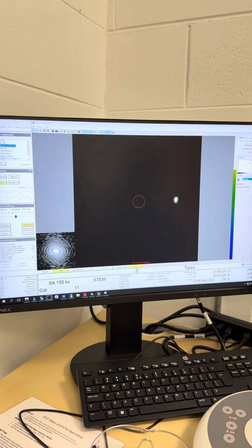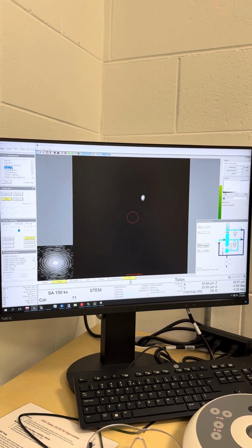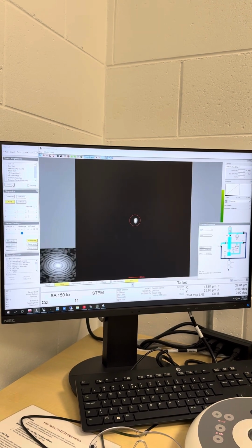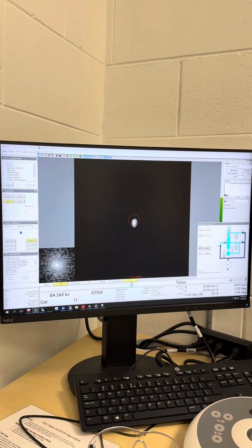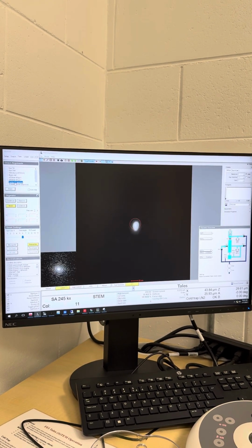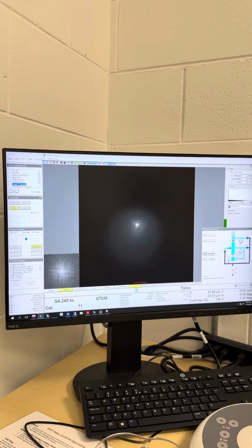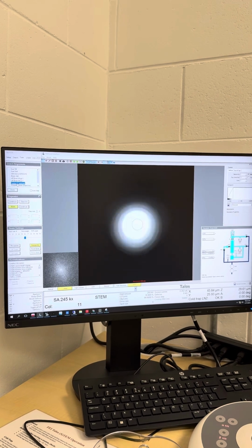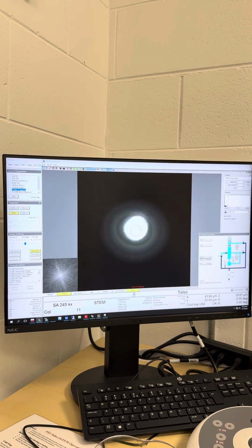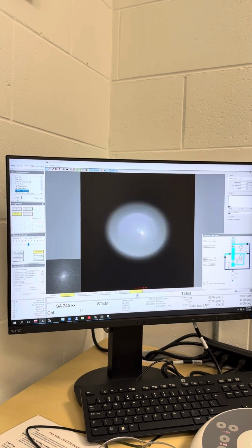So let's start with beam shift. So beam shift, X and Y knobs, you bring it to the center. That's done. I'll go to 225, which is, okay, 245, which is what I want. And then check the C2 aperture. So now it's swinging up and down, so that's the Y axis. So that means I would adjust the Y knob to make sure it expands uniformly from the center to the whole screen. So that looks fine, and then click done.